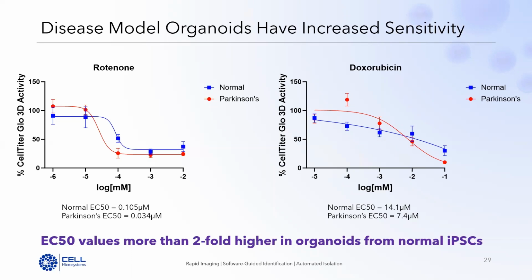In addition to being able to look at the sensitivity based on the organoids, I'd like to also point out that across these 5 replicates that you're seeing for these doses, we have very small error bars, indicating that we had well-to-well consistency within our assay.